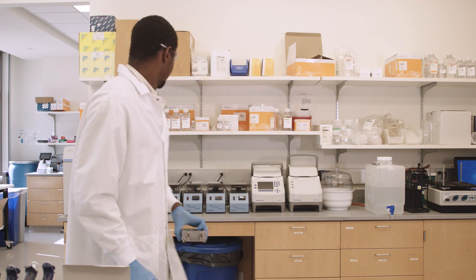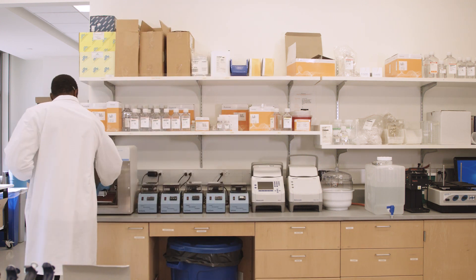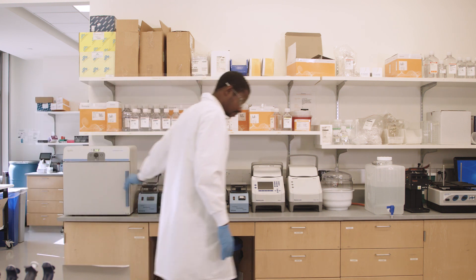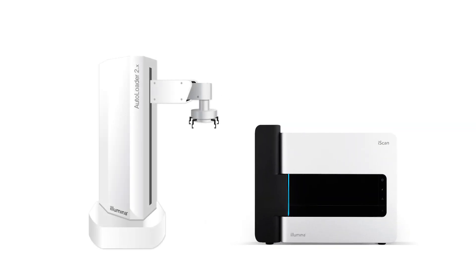You'll need additional equipment for hands-on steps, including a hybridization oven, computers, centrifuges, heat blocks, and plate shakers. You will also need an iScan to image your bead chips and may choose to use the optional autoloader to save hands-on time. Now that you have your bead chips and know what your lab will look like, let's move on to the next steps in the workflow.